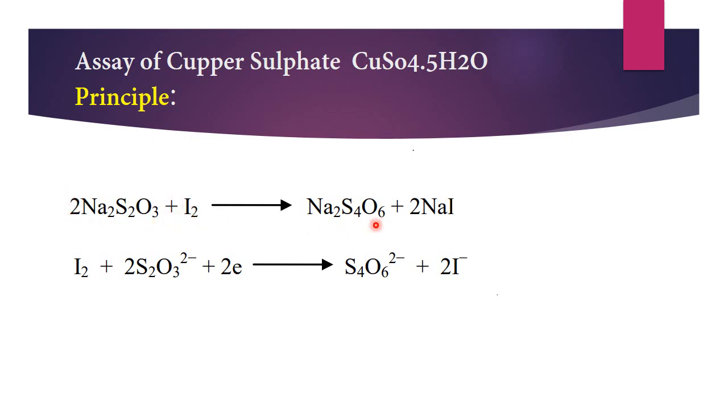الخطوة الأخيرة هي عبارة عن titration of liberated iodine with sodium thiosulfate. فإذا عبرت عنها بالمعادلة هنشوف إنه 2 مول من Na2S2O3 تتفاعل مع I2 مع الأيودين حتى تعطيني الصوديوم تترا ثايونات بلس صوديوم ايودايد. زين، by ionic equation الأيودين احنا قلنا is oxidized sodium thiosulfate، معناه الايودين زائد 2 مول من S2O3 minus 2 plus 2 الكترون راح يكتسبها الايودين، راح يعطيني S4O6 minus 2.